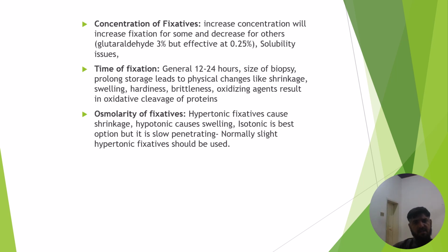Concentration of fixative is another factor that affects fixation. For example, increased concentration will increase fixation for some and decrease it for others. Glutaraldehyde can be used at 3% concentration, but it is most effective at 0.25% concentration.